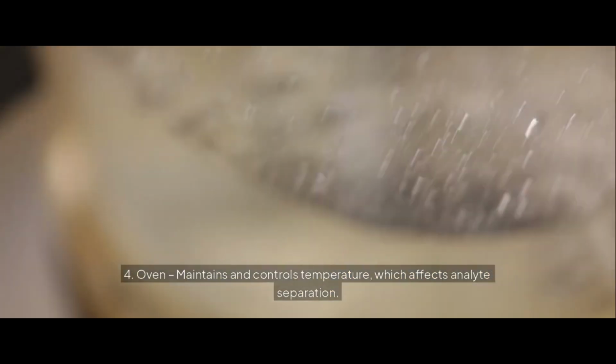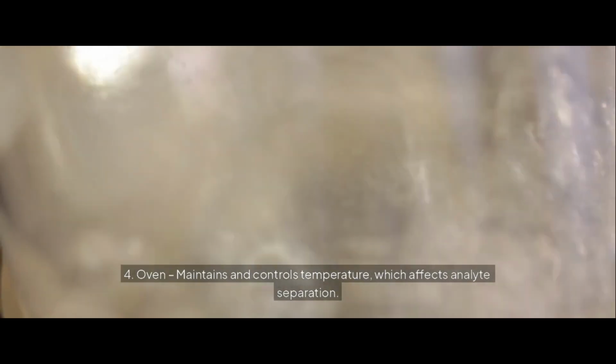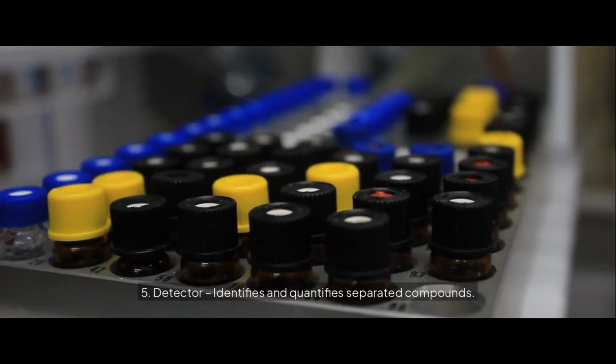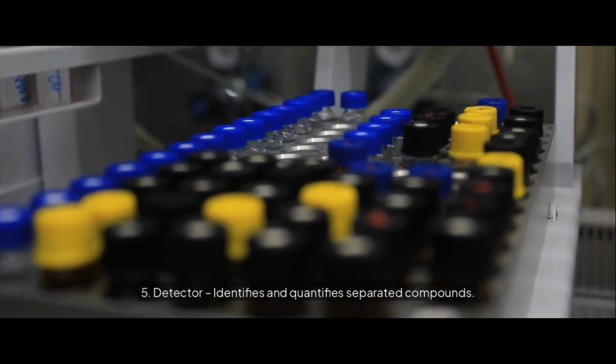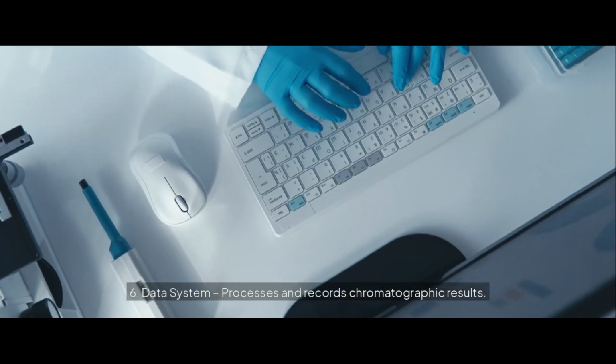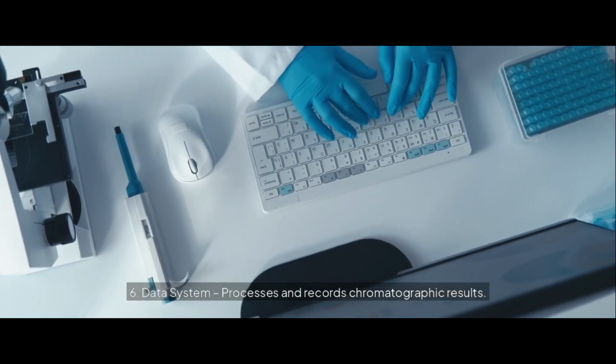analytes. 4. Oven, maintains and controls temperature, which affects analyte separation. 5. Detector, identifies and quantifies separated compounds. 6. Data system, processes and records chromatographic results.